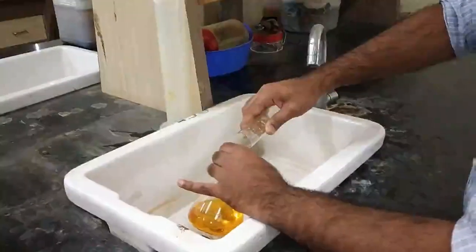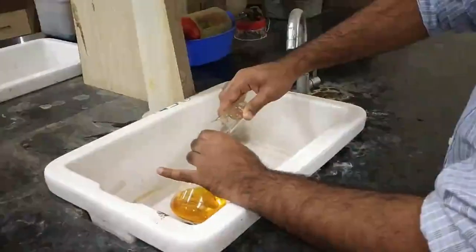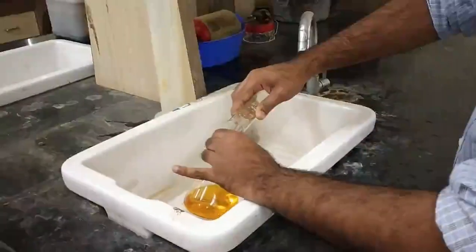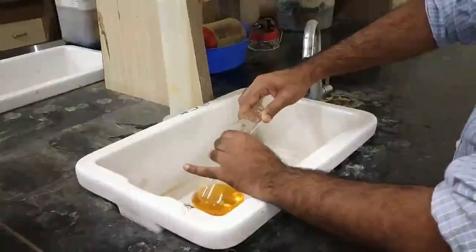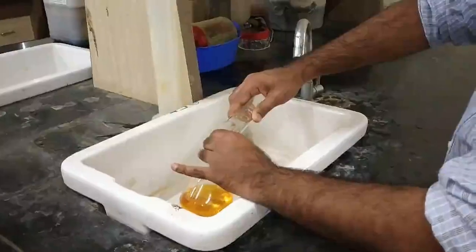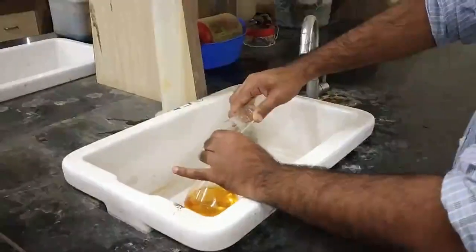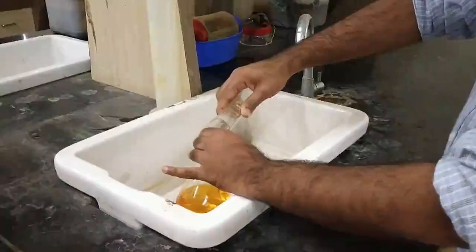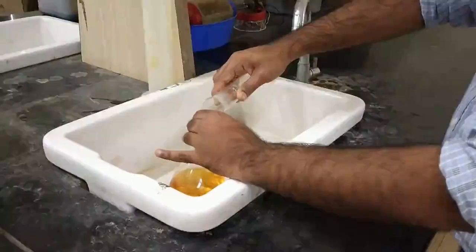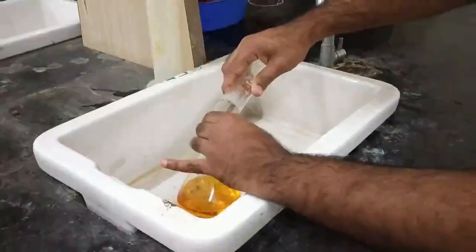The mouth of the conical flask should be away from your face, right? There are chances that fumes will come out. You shouldn't have any contact with the fumes, so the fumes shouldn't enter your nose.